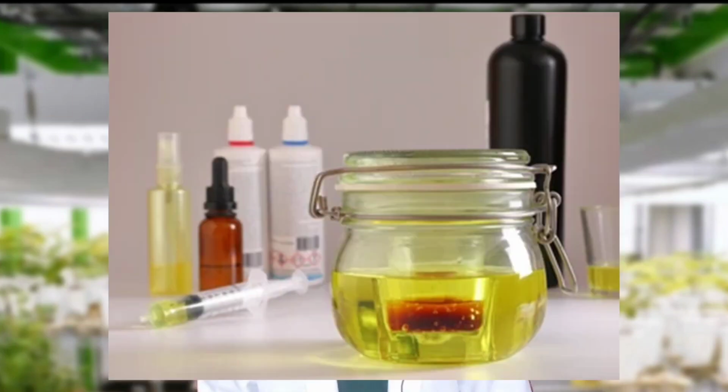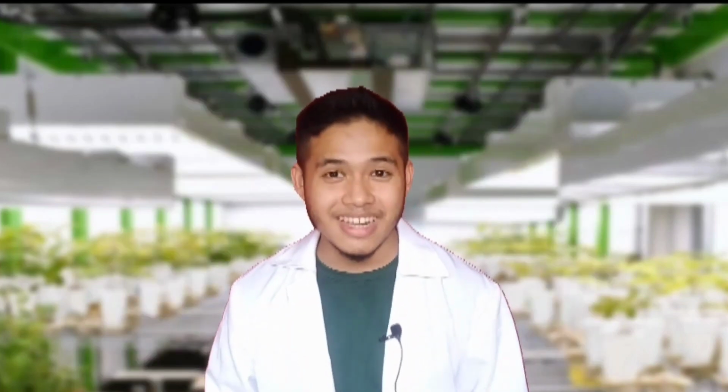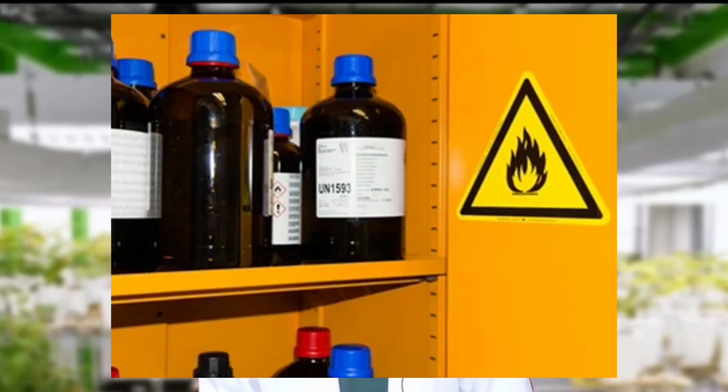Sodium hypochlorite, chlorine dioxide, and hydrogen peroxide are commonly used chemicals for this method, particularly compared to those compounds with similar properties of antimicrobials and antibiotics. Hydrogen peroxide is the most recommended chemical as it has minor side effects compared to sodium hypochlorite, which may cause dehydration towards the explants, and chlorine dioxide, which is flammable and an extremely powerful chemical.